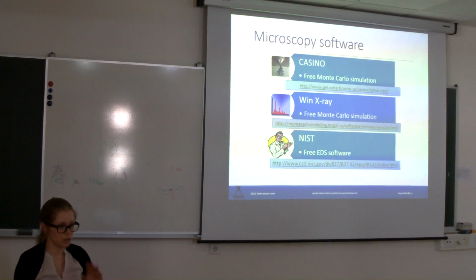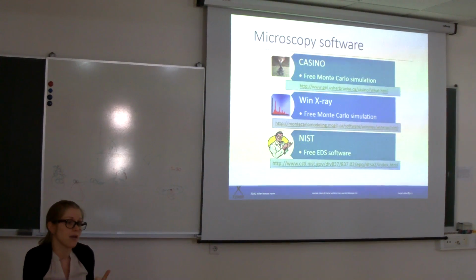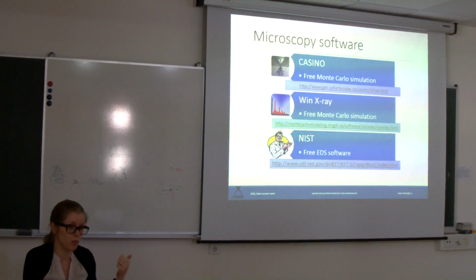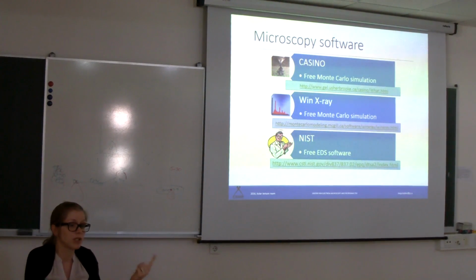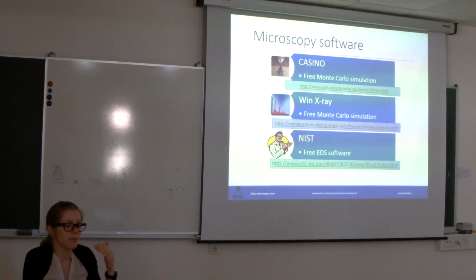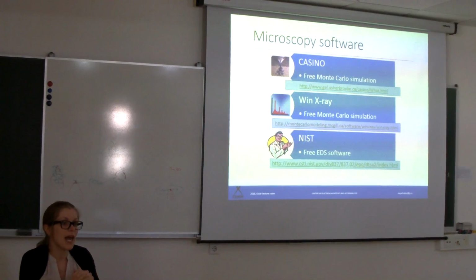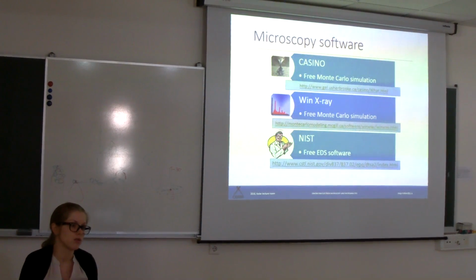Not only the interaction, but you can also check the overvoltage ratio, because in Monte Carlo it's really easy to see, if I put 5 keV and enter what your sample is, it will tell you that you won't get anything from that element, but your spatial resolution will change. The people who are really working on EDS first do the Monte Carlo simulations, see the conditions, and then go to the microscope. Okay.